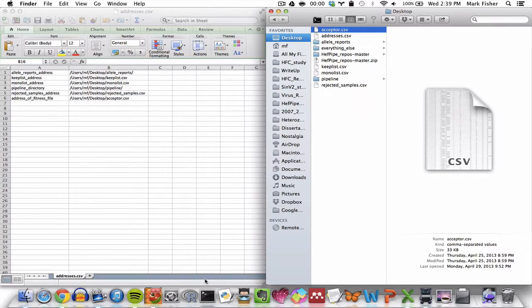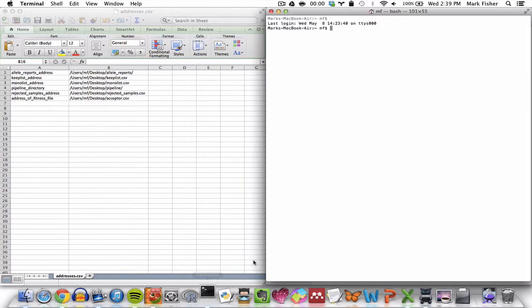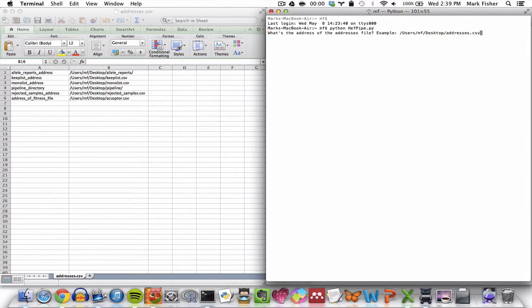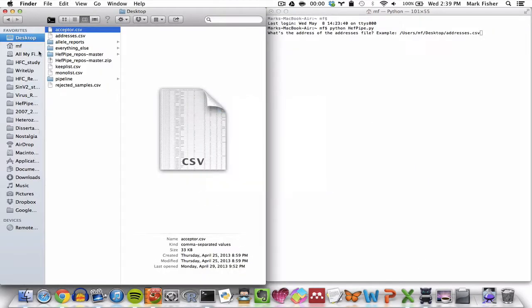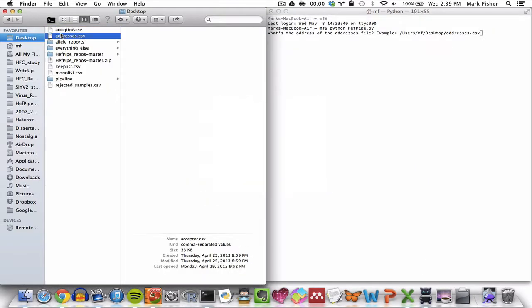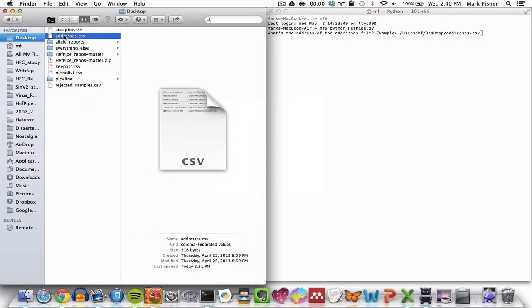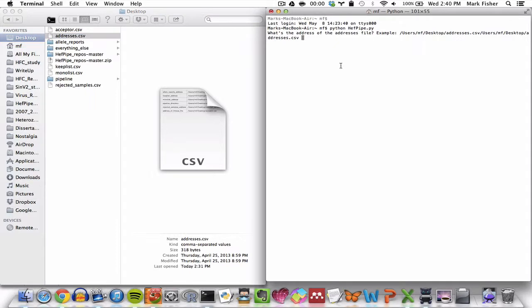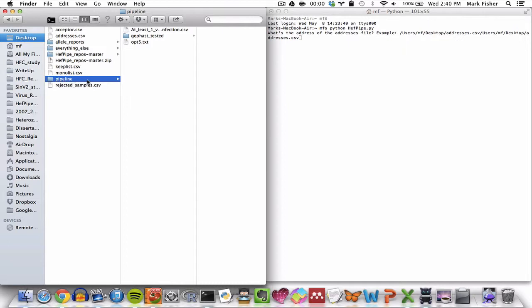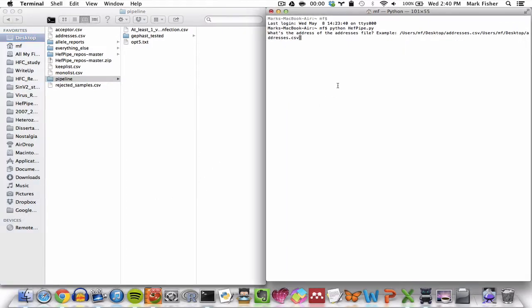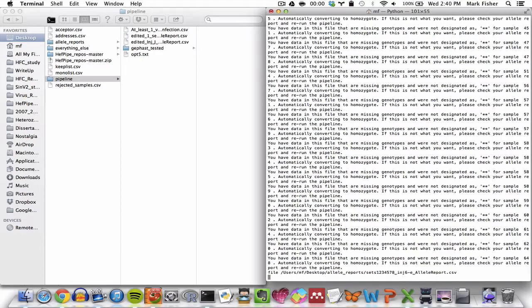So then I open terminal and I type python fpy.py and I follow the prompts. The first prompt is what's the address of the addresses file and I can either type that address manually or I can drag it from its location on my computer into terminal and terminal will automatically type its address for me, except for there will be a space at the end that I'll have to delete manually. Okay, so let's keep an eye on this pipeline directory while I hit return here.